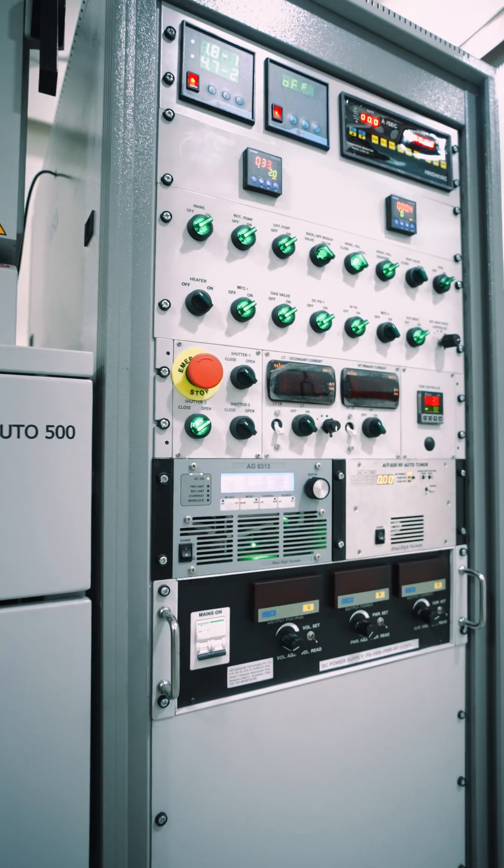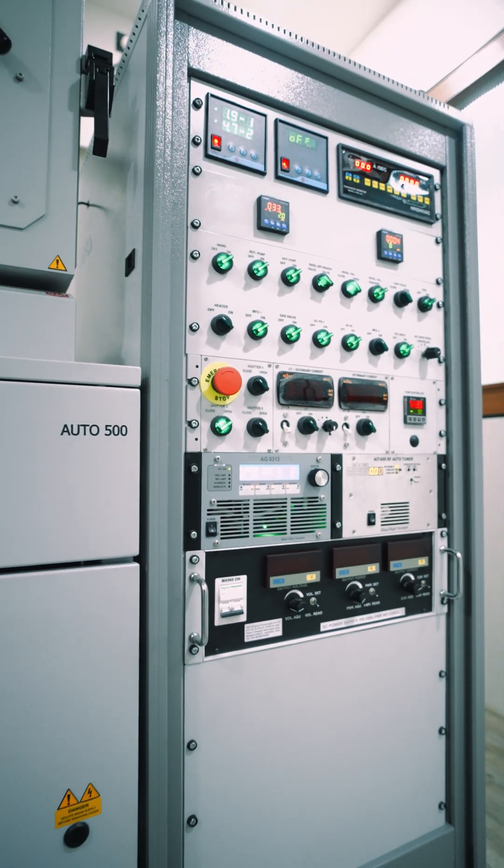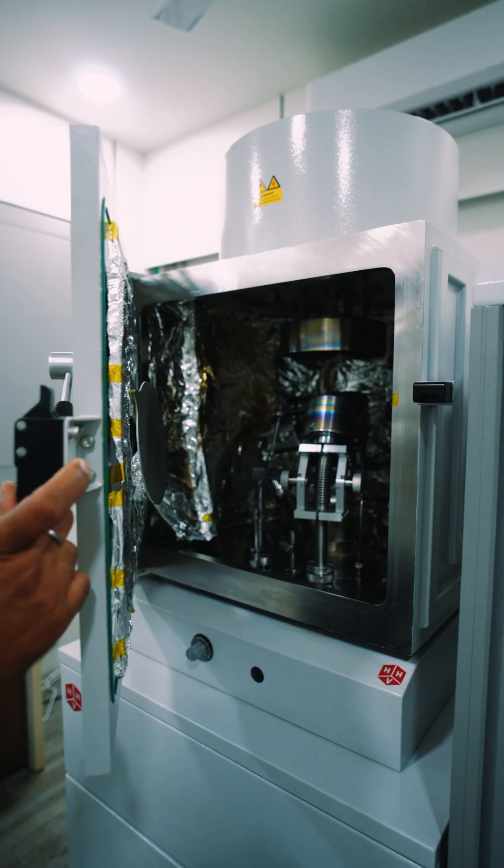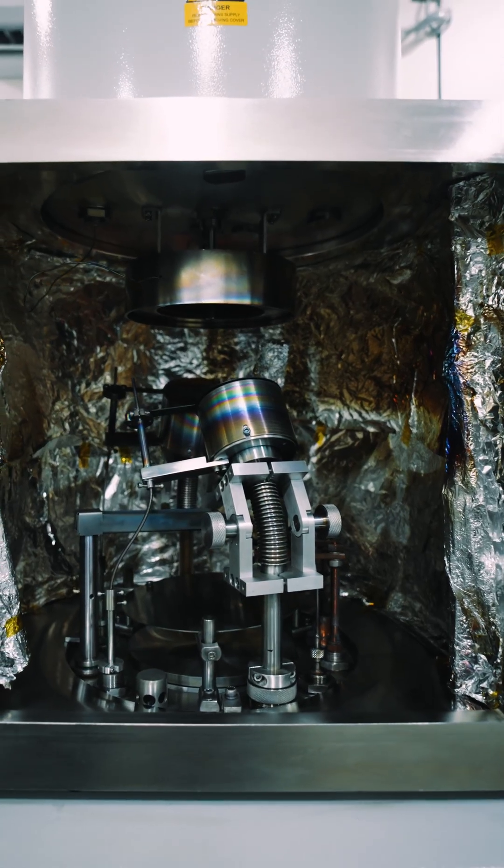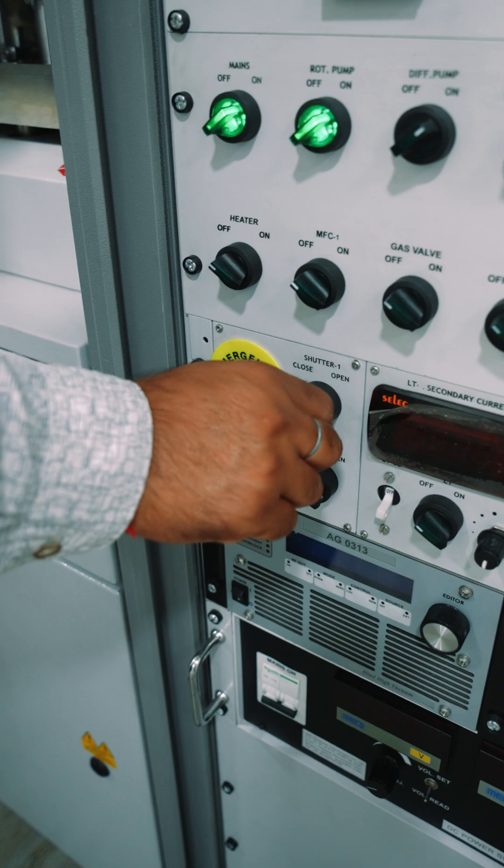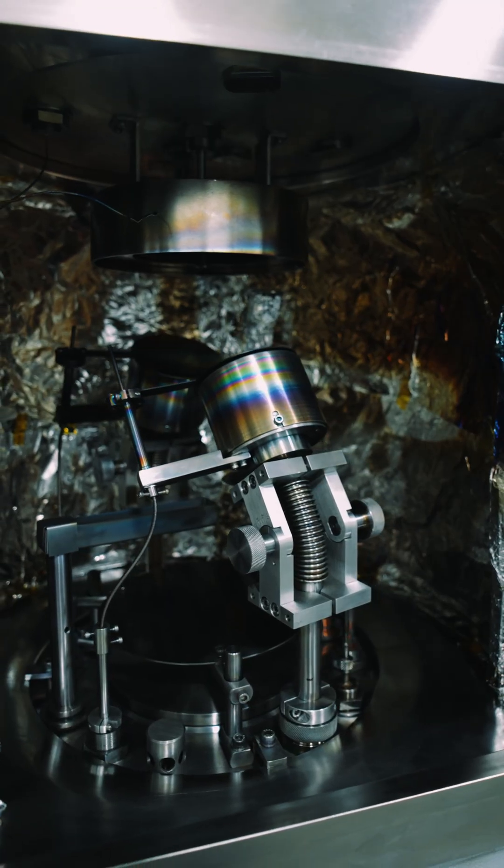Built for precision coating, this system combines RF and DC magnetron sputtering with thermal evaporation to create high-quality, smooth, ultra-thin films ranging from nanometers to a few microns in thickness.